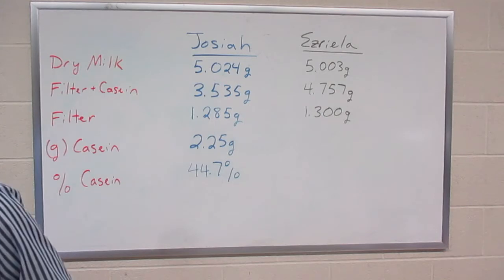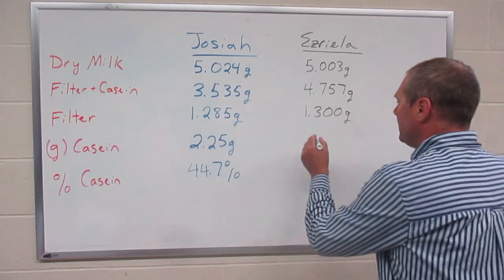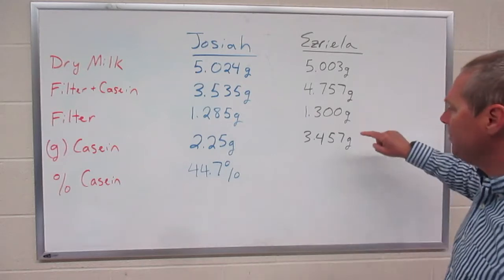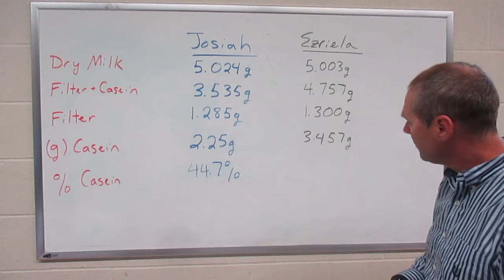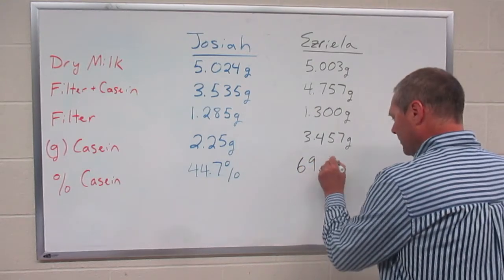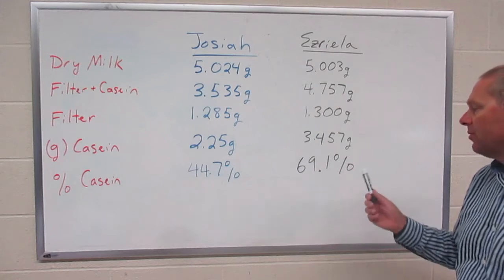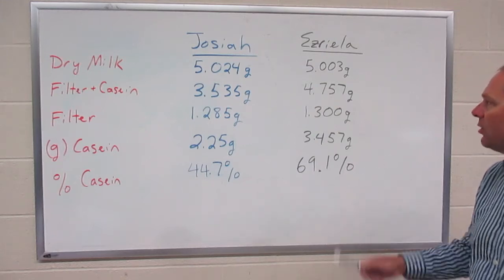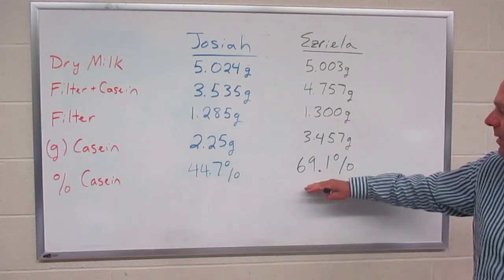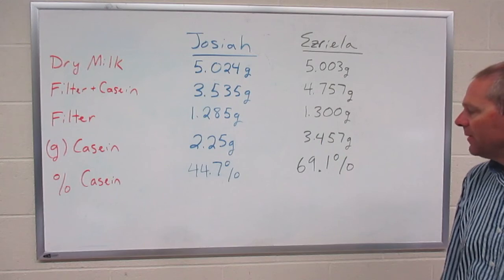Now if we do the same thing with Ezreela's, we subtract these two, which we can do pretty easily. This becomes 3.457 grams of casein, which is what she had found. Now if we take the mass of her casein divided by the mass of her dry milk, 3.457, we get 69.1% casein. So she had a little bit better recovery. Of course, this could have been because we may have added too much vinegar to her experiment and hydrolyzed the lactose sugar in there, but we really don't know. We'd have to do an analysis to see exactly if it was all casein. But Ezreela came up with 69.1% casein, and Josiah came up with 44.7% casein. So these are how you would go through and do the calculations for this experiment. If you have any questions, please let me know.